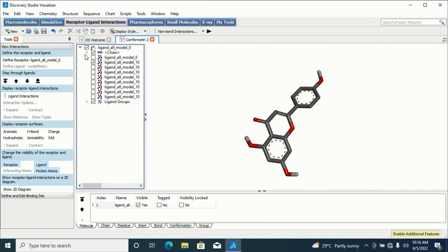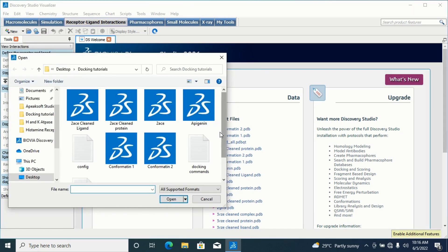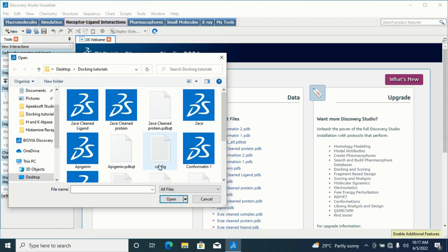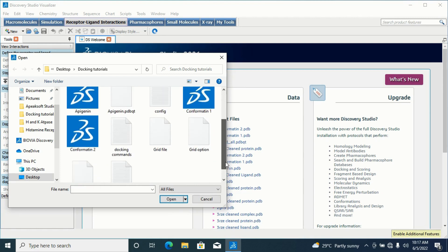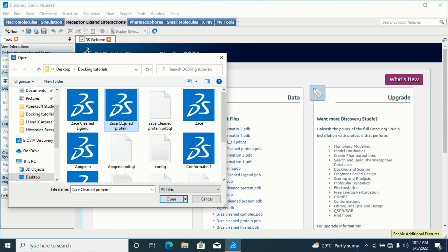Now I'll close this and go load my protein. I'll go to File then Open and search for my clean protein. Don't open the protein you have in PDBQT format — Discovery Studio cannot open that. What you open is your normal cleaned protein — I named mine 'clean protein' because I have removed water molecules, the internal ligand, and the heteroatoms. Simply click on it and open it.